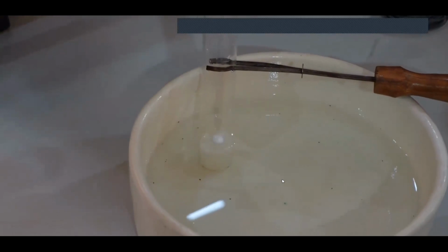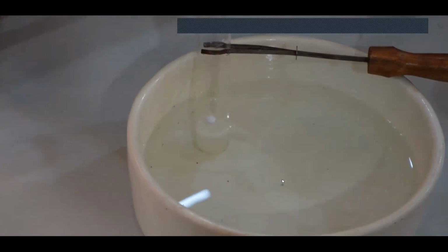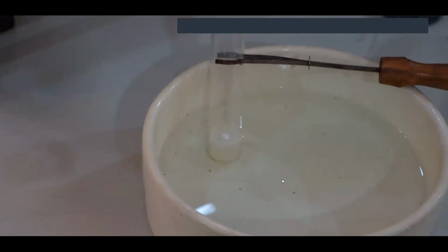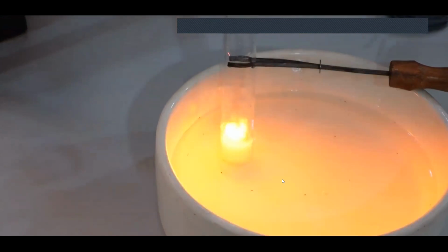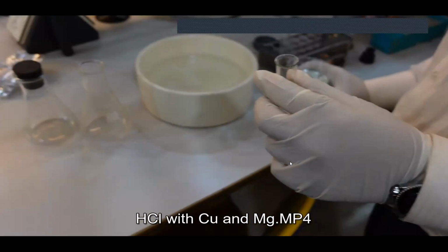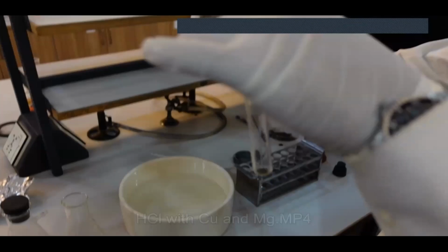There's a lot of hydrogen gas coming out. And there you go. It's explosive. In a large quantity, hydrogen will be explosive. And there's a high temperature, actually. It's a very exothermic reaction. And to cool it down, I added it to water. But let's see how other metals do this. So now I have HCl and I'm going to add magnesium into that.